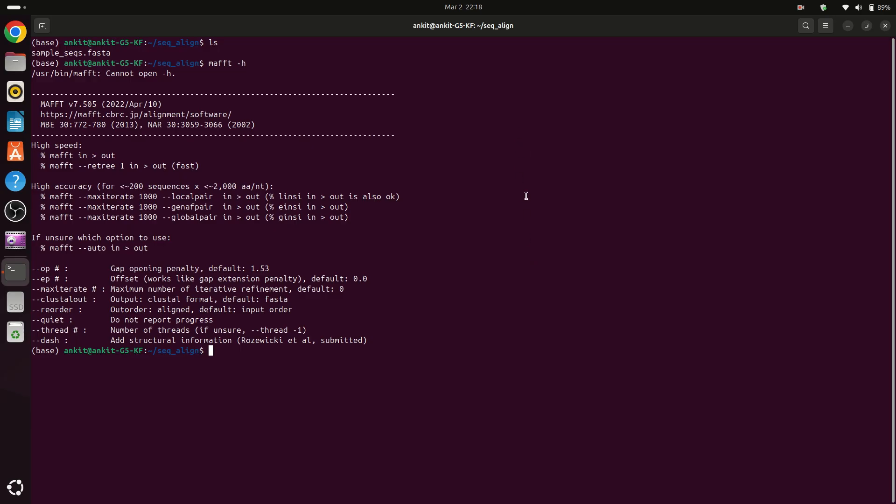What I mean is if your alignment is producing first five, then nine, then seven, then it will store the best alignments. But for that we have to use maxiterate option.